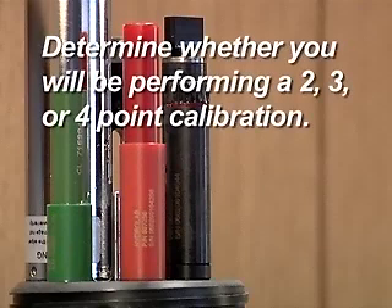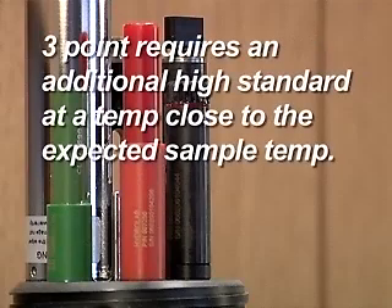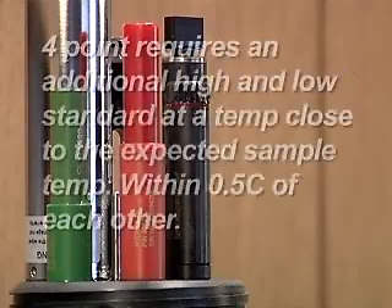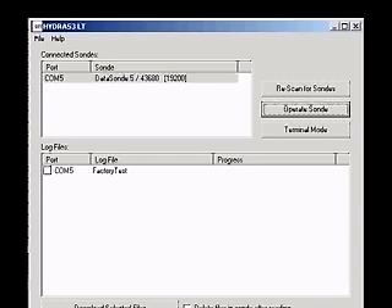Determine whether you will be performing 2, 3, or 4-point calibration. A 2-point calibration requires a high and low standard, both at room temperature. A 3-point calibration requires an additional high standard at a temperature close to the expected sample temperature. A 4-point calibration requires an additional high and low standard close to the expected sample temperature, and within 0.5 centigrade of each other.